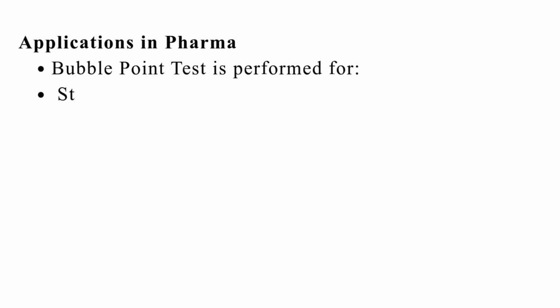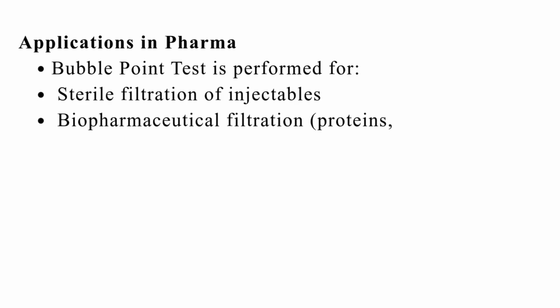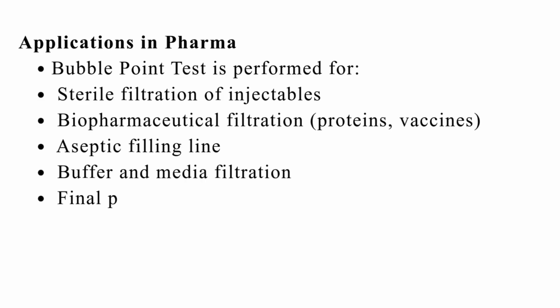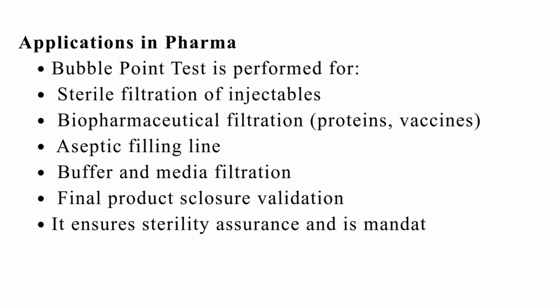Applications in pharma. Bubble point test is performed for sterile filtration of injectables, biopharmaceutical filtration, proteins, vaccines, aseptic filling line, buffer and media filtration, final product container closure. Validation. It ensures sterility assurance and is mandatory for every batch.